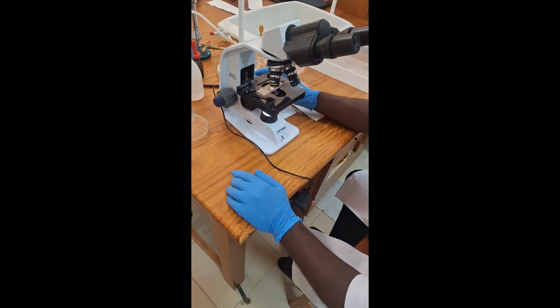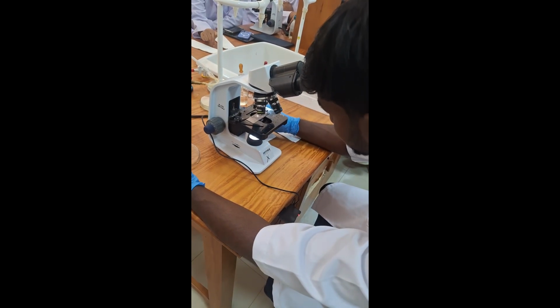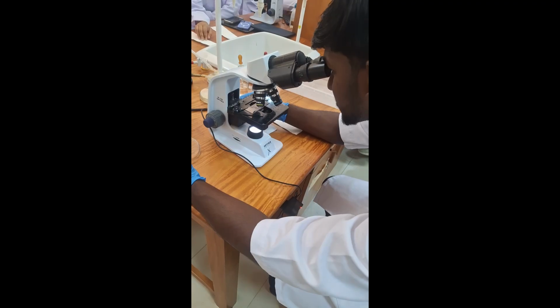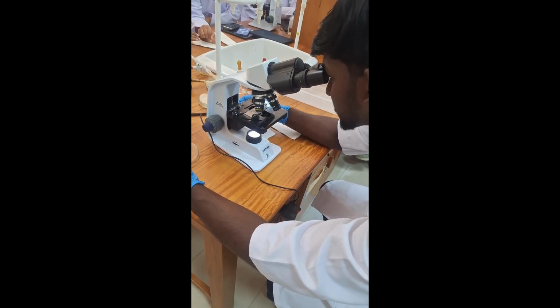Place the slide on the microscope stage. Start with low magnification to locate the smear. Move to higher magnification to focus the area. Place a drop of immersion oil on the smear. Observe using the 100 times oil immersion objective.